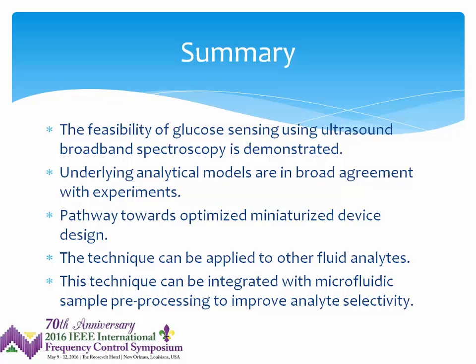So essentially this work demonstrates the feasibility of using a broadband swept frequency ultrasound technique to detect glucose in microfluidic channels. The underlying analytical models are in broad agreement with experiments, but of course further work is needed to capture some of the deviations that you saw between the models and experiment.